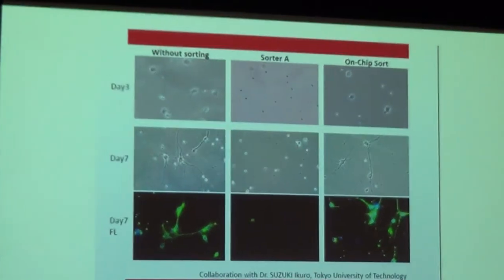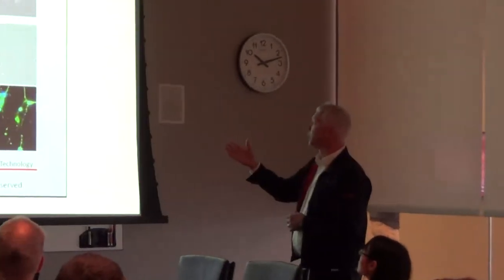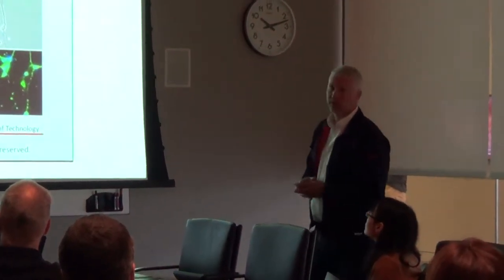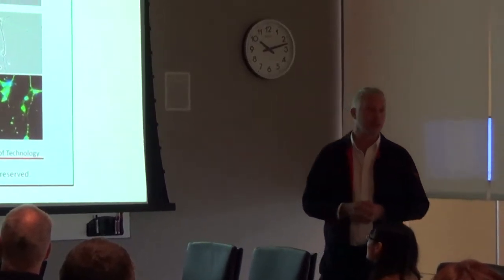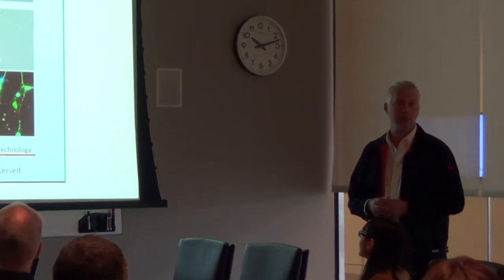So we've done one of the examples that we've shown with the hippocampus, the rat hippocampal cells, is that in the competitive sorter those cells die and are not rejuvenated after 7 days, and we show viable cells with the on-chip sorter.